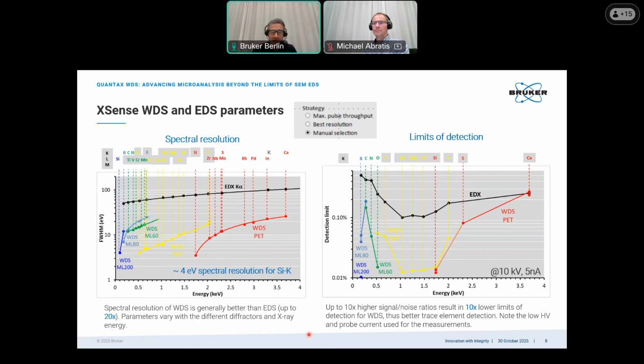What we can tell is that the distance from the sample to the optic is always 18 millimeters. So there's a huge amount of space between the sample and the optic, and there should be enough gap so that the WDS will not heat up. But we cannot promise that. What we definitely can promise is that the optic is fully retractable. So if the stage is only used in conjunction with EDS, then it should definitely be no issue.